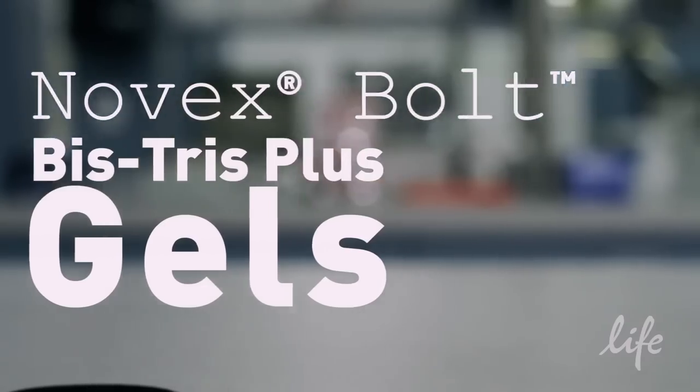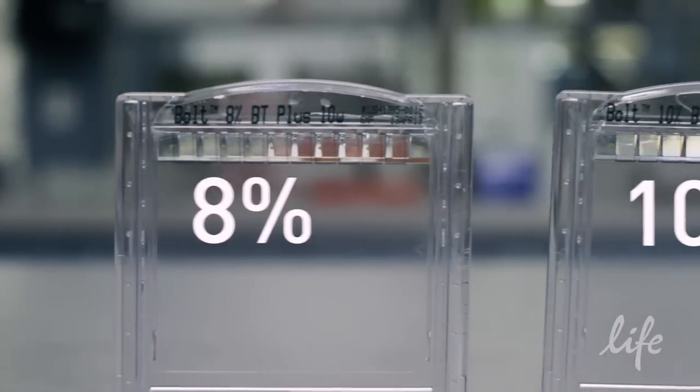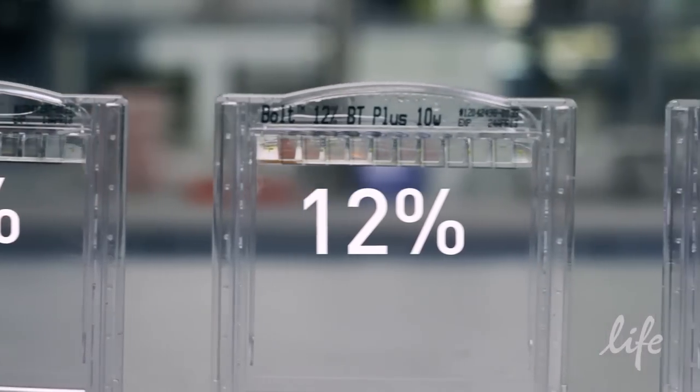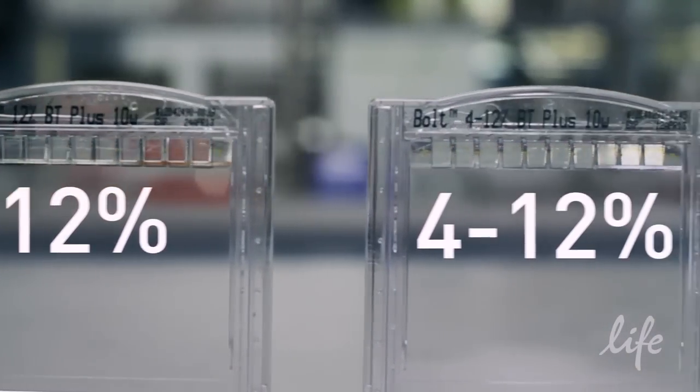Bolt Gels are designed for optimal western performance. Novex Bolt Bistris Plus Gels come in different concentrations and gradients. Choose the one best suited for your experiment depending upon the molecular weight of the proteins you're working with, the sample volume, and the number of samples.